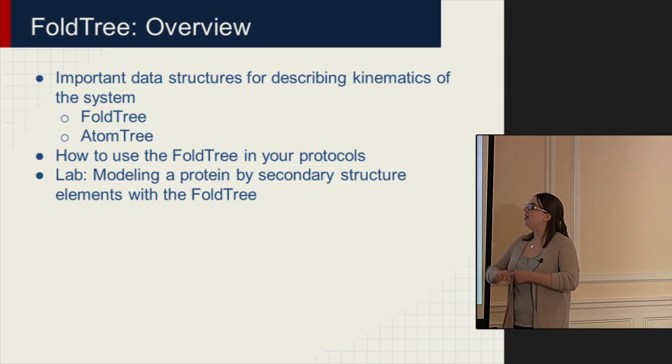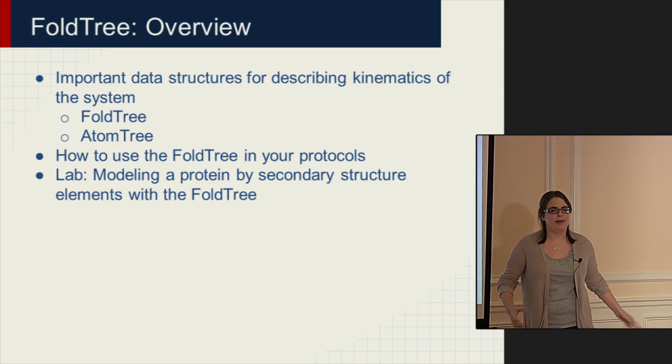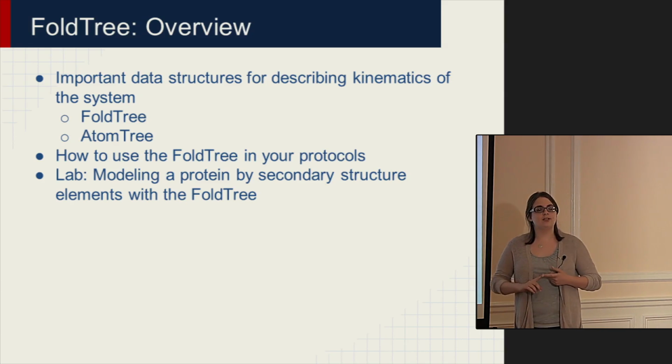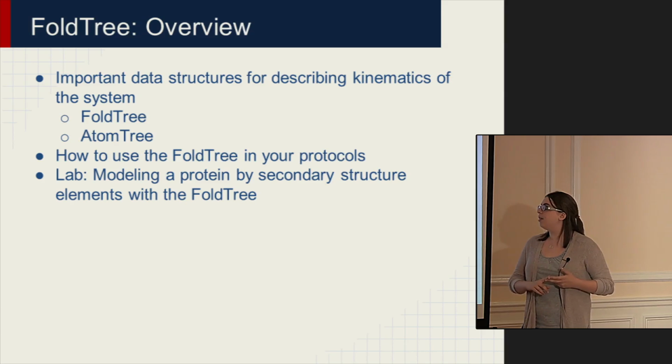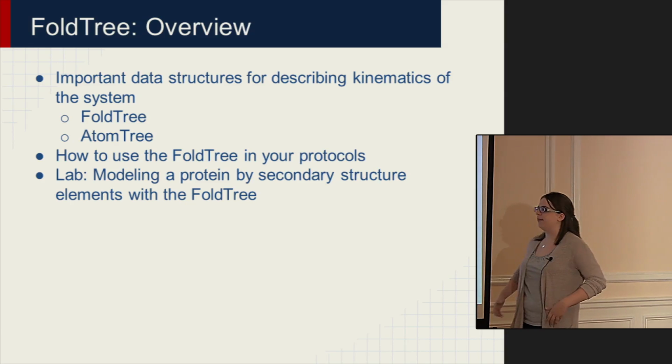First, we're going to talk about some of the motivation for the FoldTree. There are lots of different motivations that you can talk about. I'm probably going to just talk about one of them. Then a little bit about the data structures, the FoldTree, the atom tree in depth, and how you can use the FoldTree and interact with it to get different types of modeling in your protocols and different benefits.